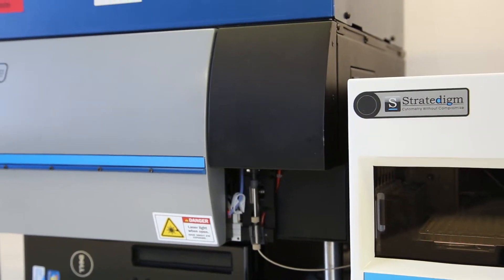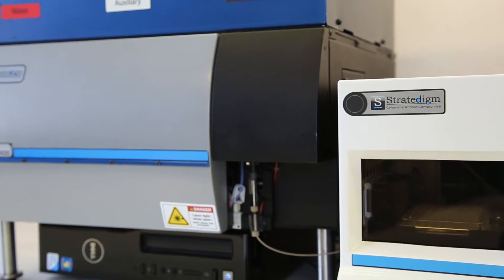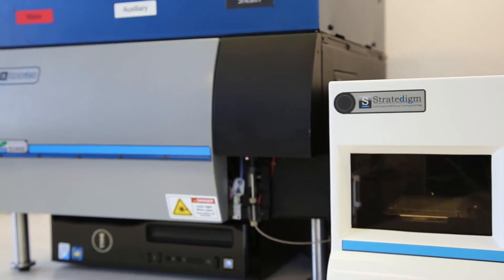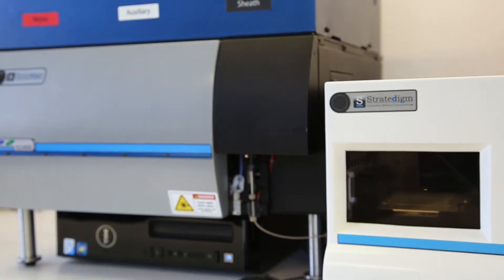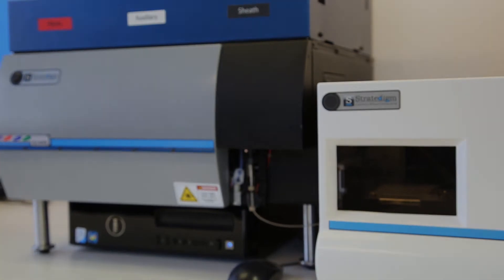The A600 High Throughput Auto Sampler, truly, cytometry without compromise.